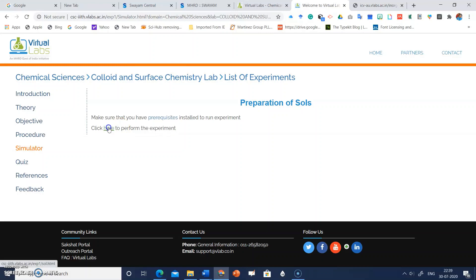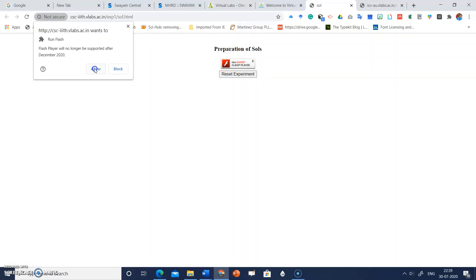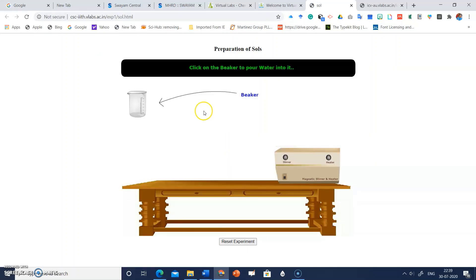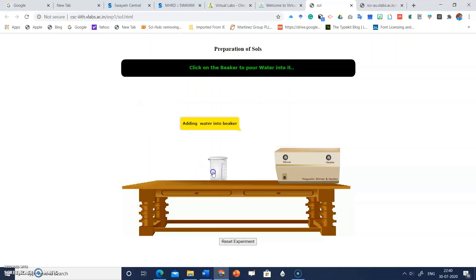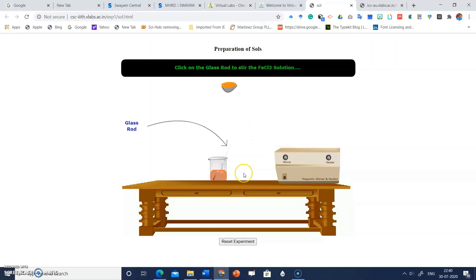Click on 'Simulator.' Make sure you have prerequisites installed to run the experiment. For this experiment, you need Adobe Flash Player — click 'Allow.' Now the simulation is running. Follow the on-screen instructions: click on the beaker to pour water, then add ferric chloride into the beaker, then click on the glass rod to stir the ferric chloride.